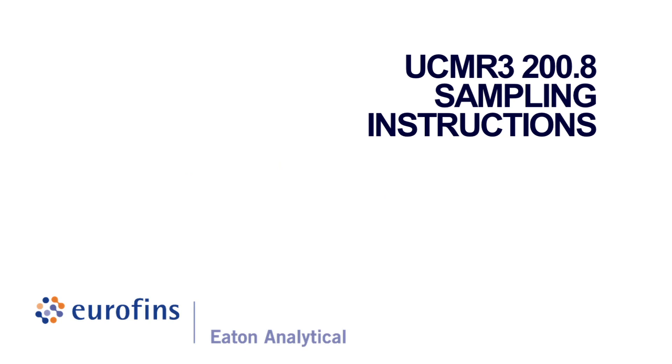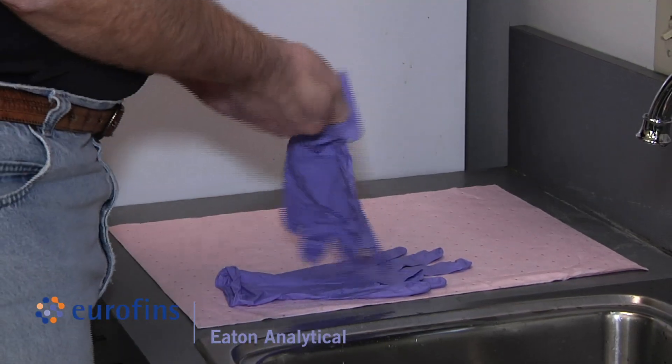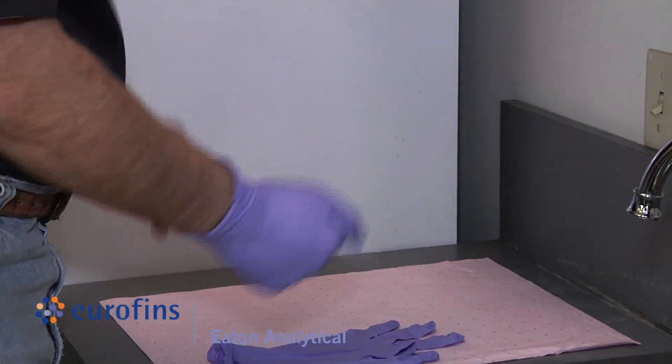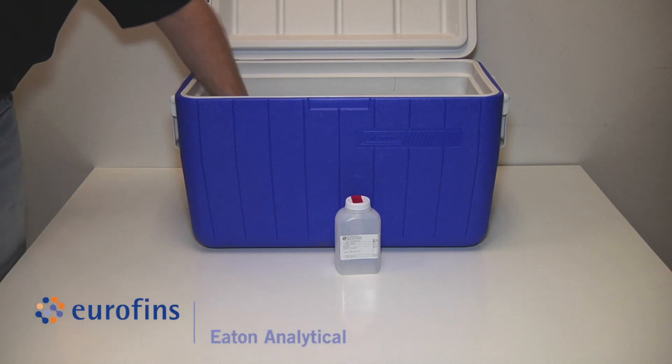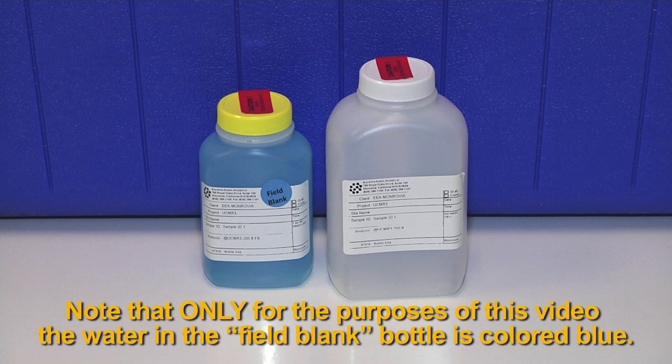UCMR 3 Method 200.8 sampling instructions. Wash your hands before sampling and wear the powderless nitrile gloves, which are included in the kit, during sampling and sample handling. Your 200.8 kit should include one empty sample bottle with preservative and one field blank bottle. Note that only for the purposes of this video, the water in the field blank bottle is colored blue.